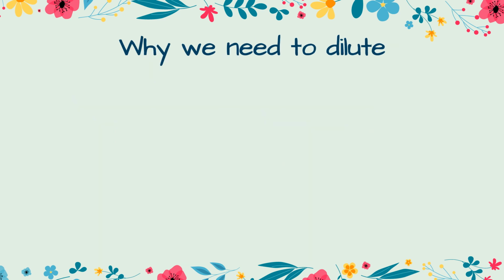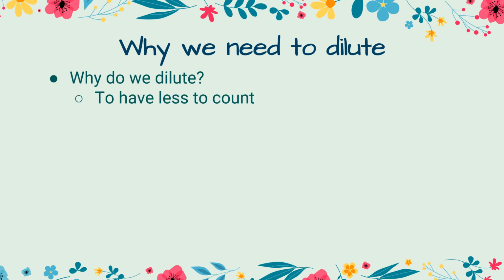So why do we dilute? Honestly, it's to count less. I don't want to count that many, so you don't want to count that many anyways. But hey, at least we don't have to count millions of bacteria or atoms or whatever it may be.